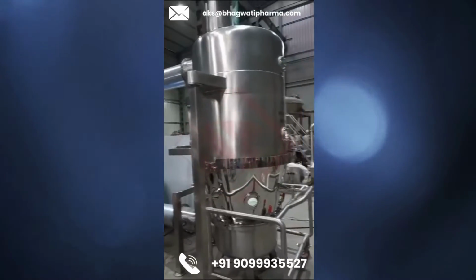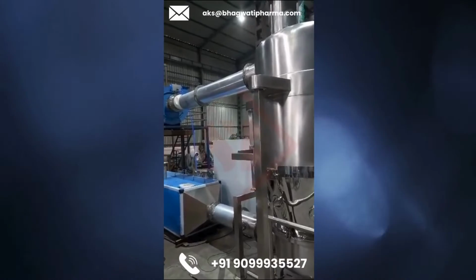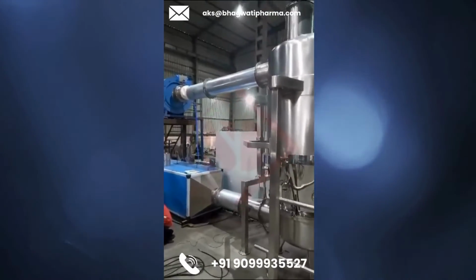Overall, fluid bed dryers offer efficient, uniform, and gentle drying solutions for a variety of solid materials, making them widely used in industries where precise control over moisture content and product quality is essential.